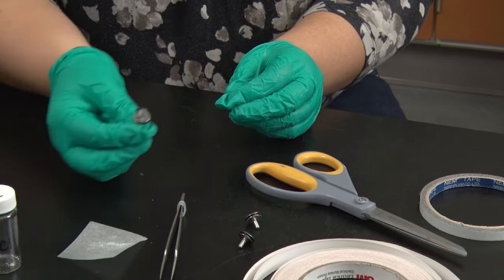Remember, the SEM operates under vacuum, so first I will vent the chamber to atmosphere and then load the sample. The sample stub has a small post that fits into the sample stage. A small set screw holds the sample in place. I'm also going to load a similar salt sample that hasn't been coated with any metal, so we can compare the effect of the metal coating on imaging.